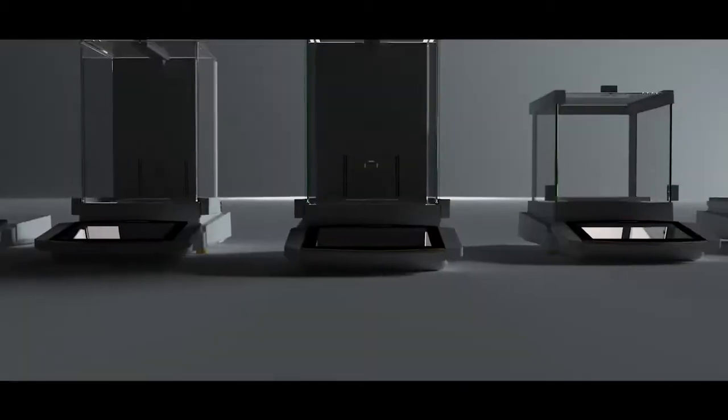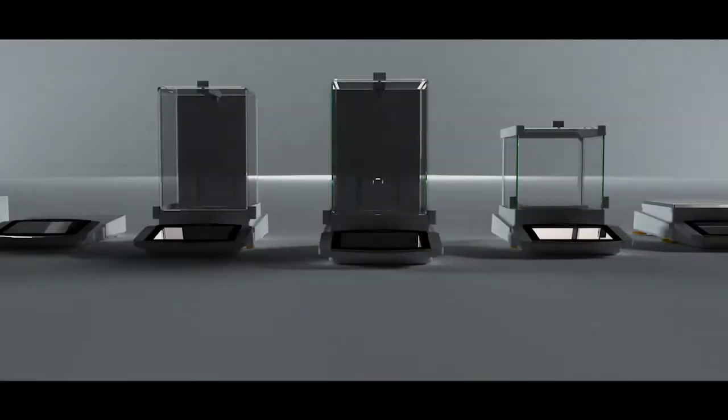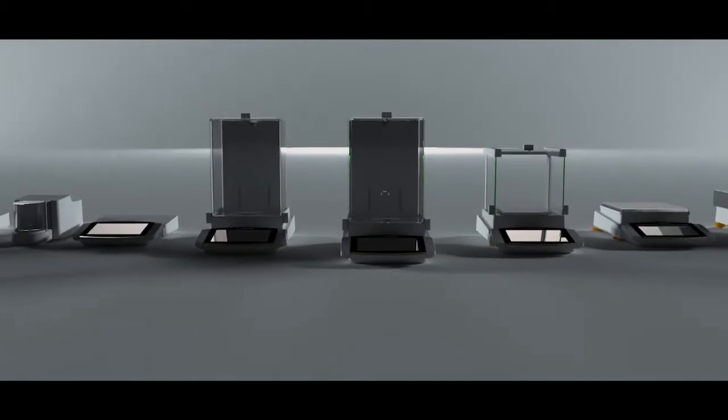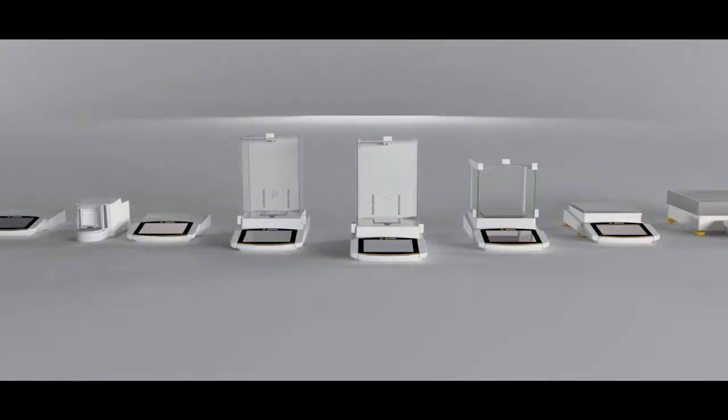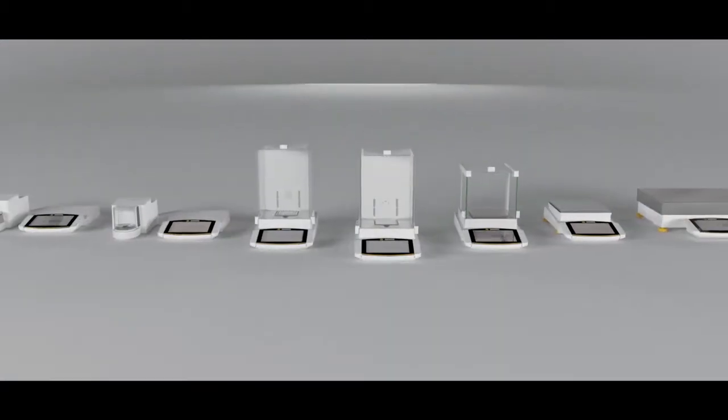The time has come for the next generation of Sartorius Premium Balances. Cubis II.